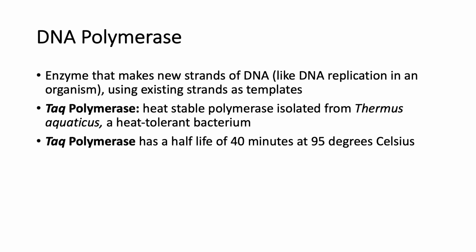Next is DNA polymerase. DNA polymerases are critical players in replicating the target DNA. DNA polymerase is an enzyme that makes new strands of DNA, like DNA replication in an organism, using existing strands as templates. Amplification is usually carried out by Taq polymerase, which is a thermostable DNA polymerase I enzyme from Thermus aquaticus.